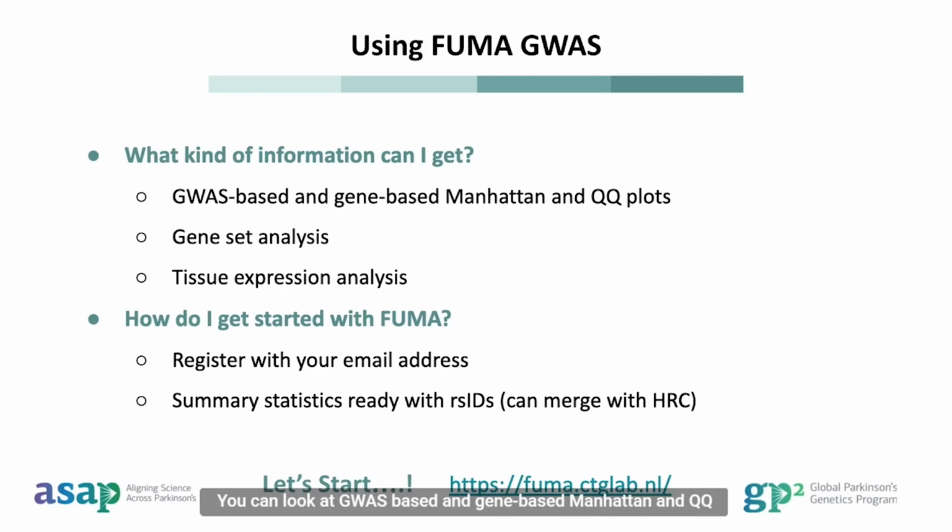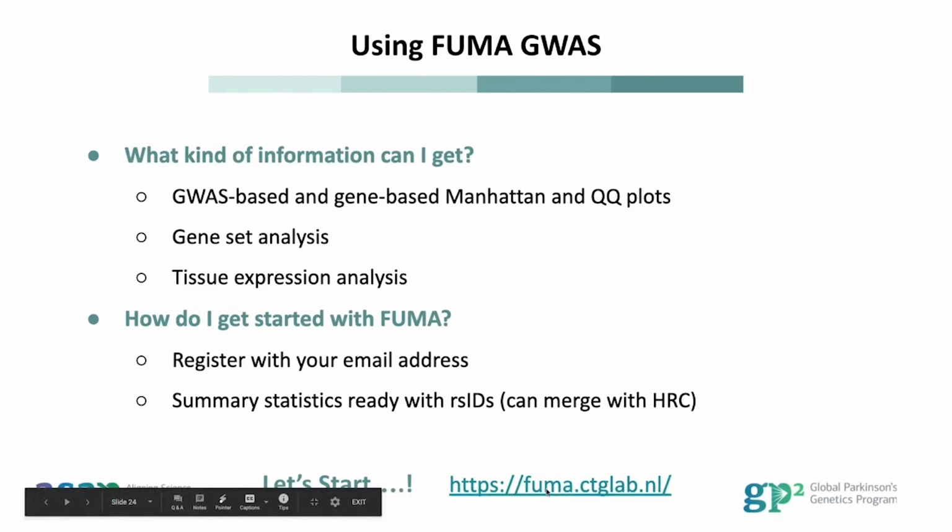You can look at GWAS-based and gene-based Manhattan and QQ plots, similar to the ones covered earlier in this module. A few other things that they look at and report are gene set and tissue expression analyses. Let's have a look at their website.